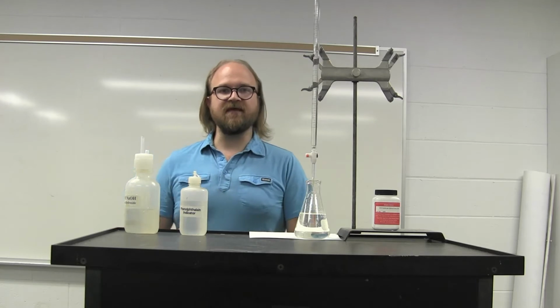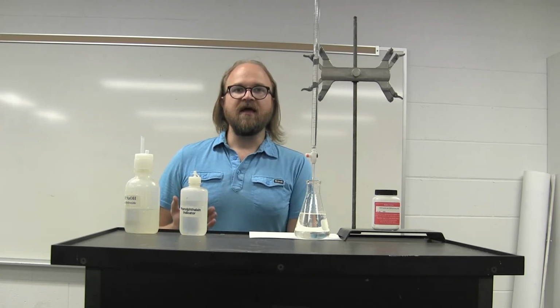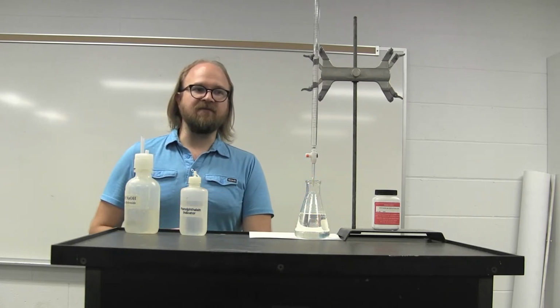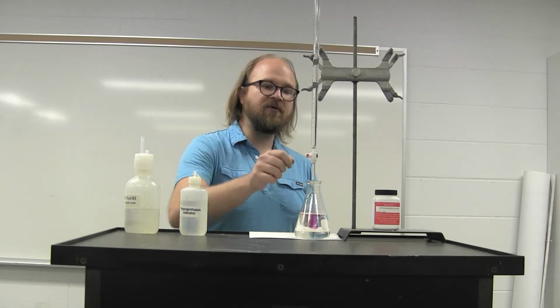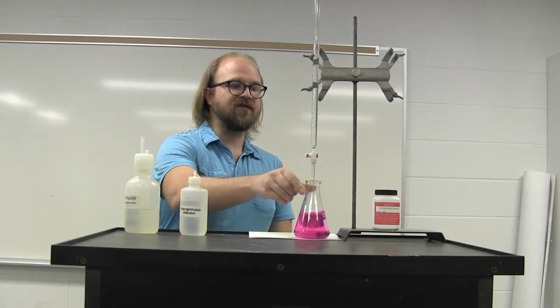Many times in this type of titration, an indicator is used that will change color, indicating that the reaction is complete. When you have this type of titration, you would want to get the solution where a single drop of the titrant in the burette will cause a full change in color.